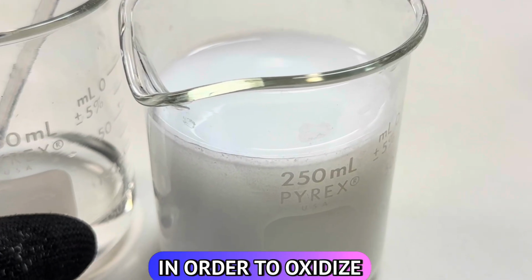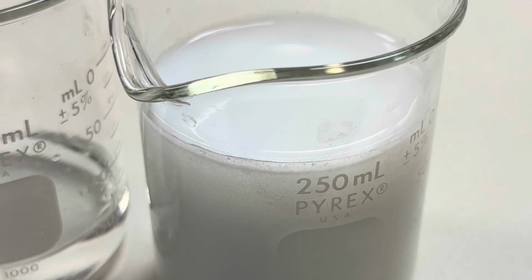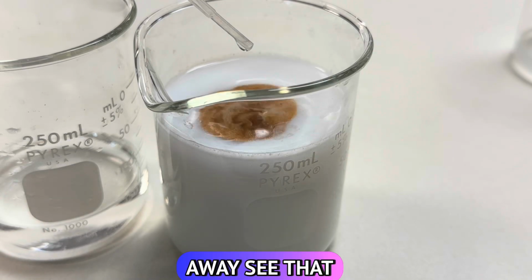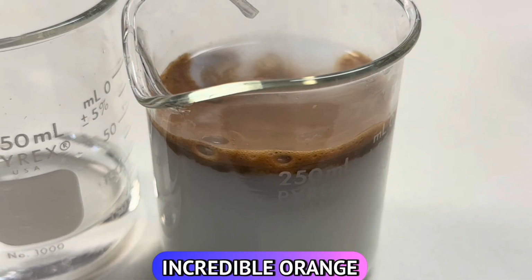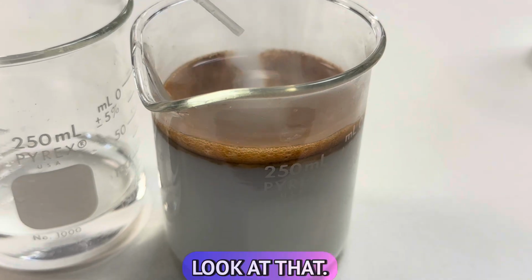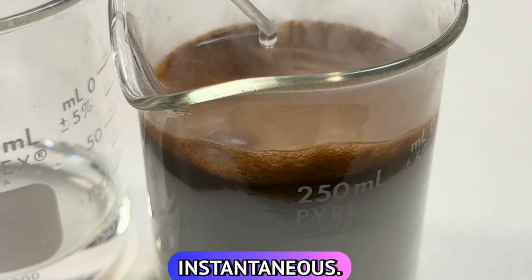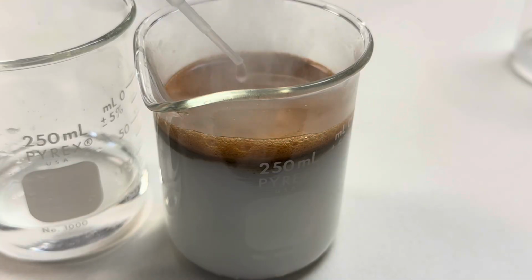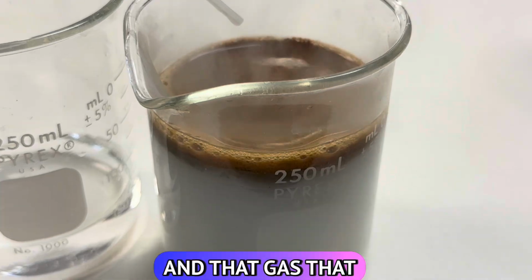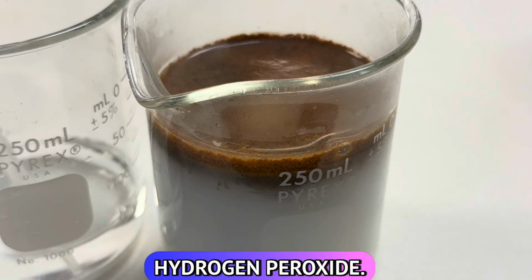Now, in order to oxidize the lead so it precipitates lead oxide, we're going to use hydrogen peroxide, and you can right away see that incredible orange precipitate. Look at that. It's just instantaneous. And the gas that you see released is oxygen from the hydrogen peroxide.